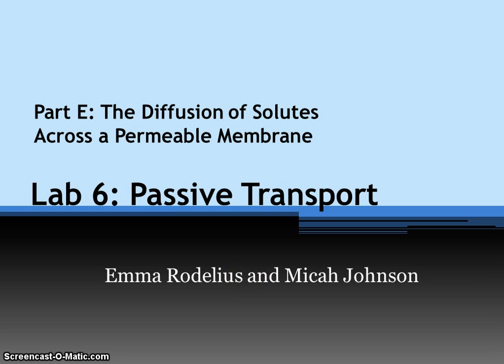Lab 6, Passive Transport, Part E, The Diffusion of Solutes Across a Permeable Membrane, by Emma and Micah.